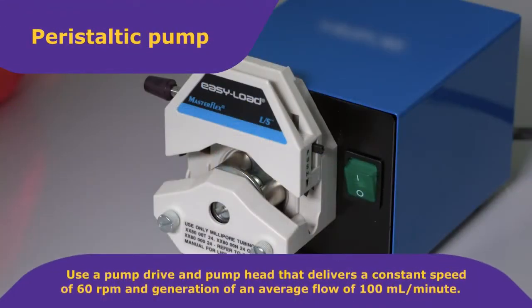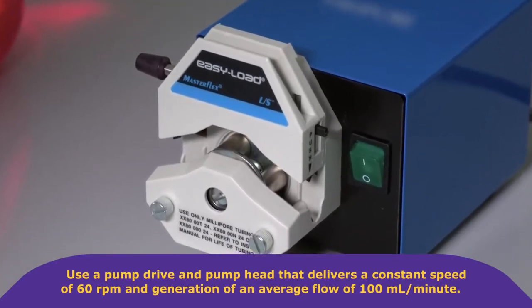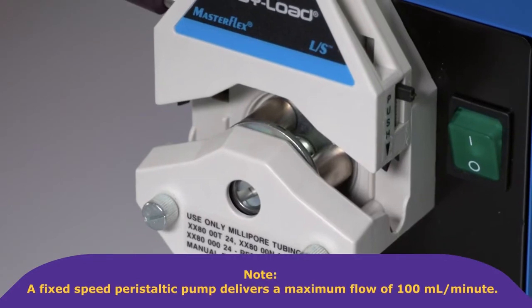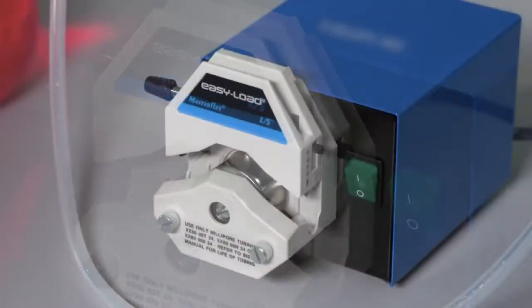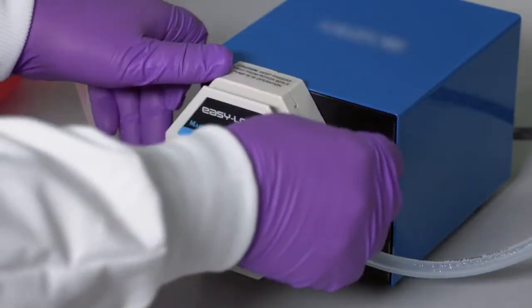Use a pump drive and pump head that delivers a constant speed of 60 RPM and generation of an average flow of 100 mils per minute. Note, a fixed speed peristaltic pump delivers a maximum flow of 100 mils per minute. Load the pump head with 7.93 millimeter ID silicone tubing.